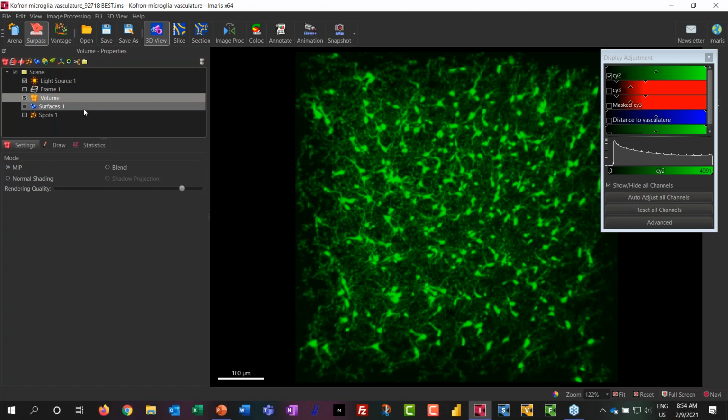We're running a bunch of simulations in the background and calculating the shortest distance from the spots to the surfaces for all of those simulations. In those cases, we want to make this fast and we don't want to make it burdensome for you. So we have limited it to using spots and how far away they are from a reference surface object or component. But I understand that it might be limiting.